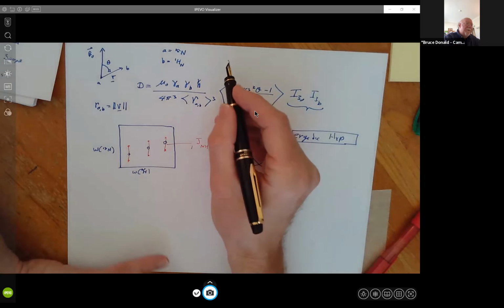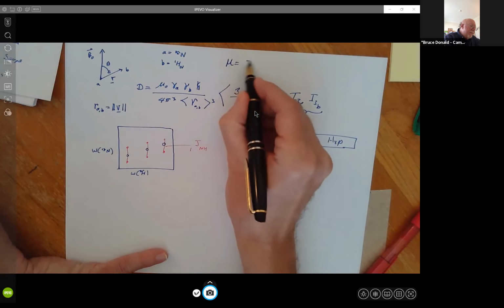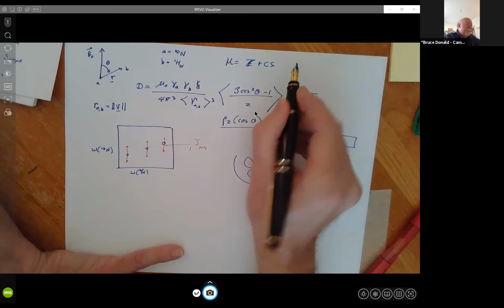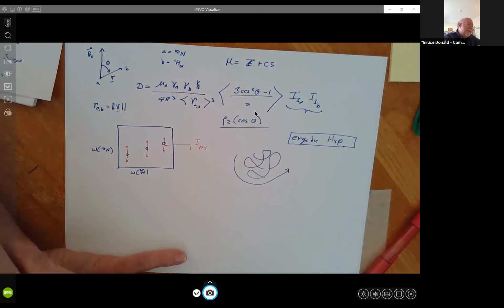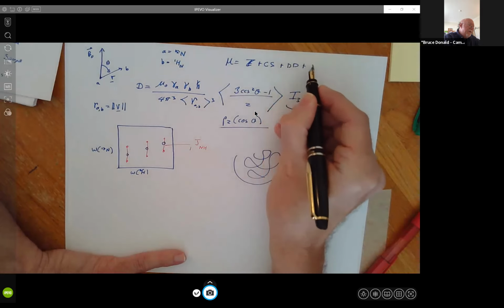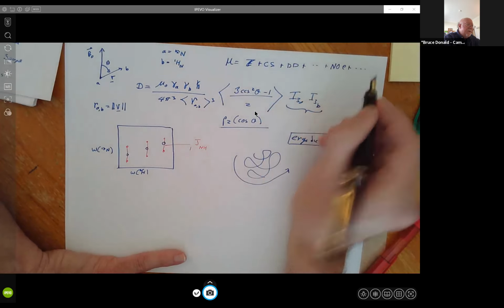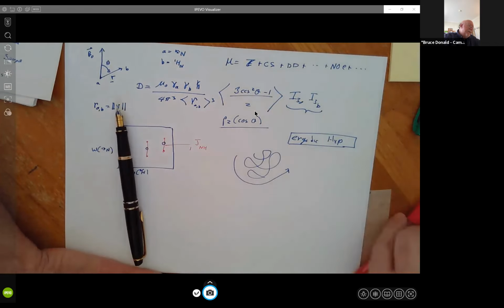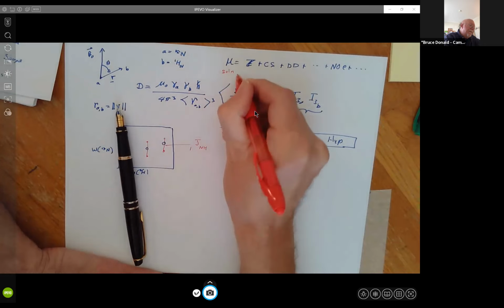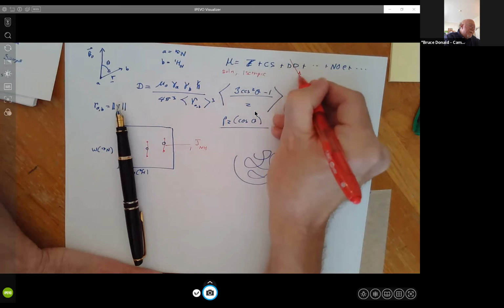And that's why before, when I wrote down the Hamiltonian for a typical protein experiment, we had the Zeeman potential, we have the chemical shift potential that determines, very big actually, determines what frequency each nucleus has. Then we have the dipole-dipole interaction. And then later on, way down here, we might have the NOE if we use the appropriate pulse sequences for distances. But the main thing is that in solution, outright isotropic, meaning the same in all directions, this actually averages out to zero.